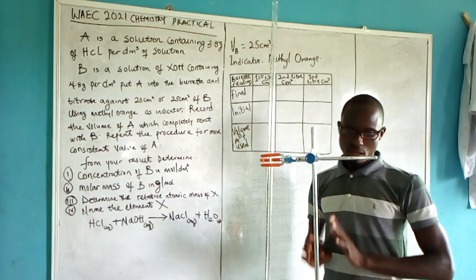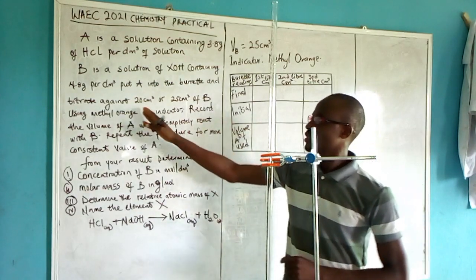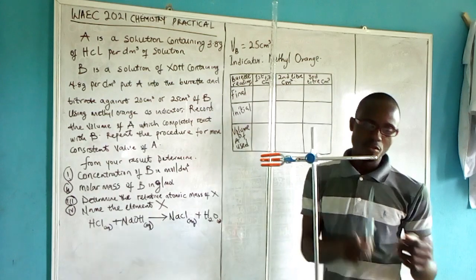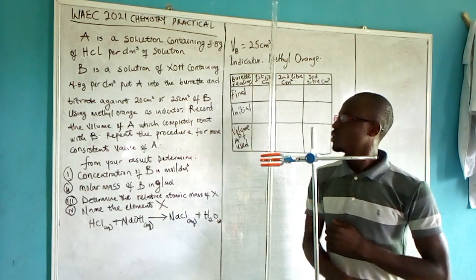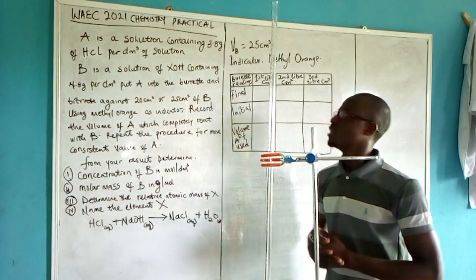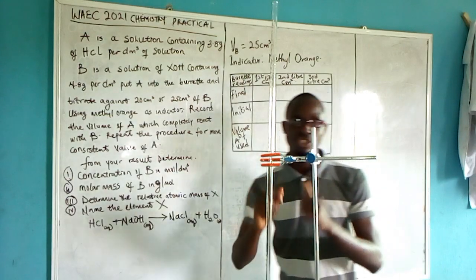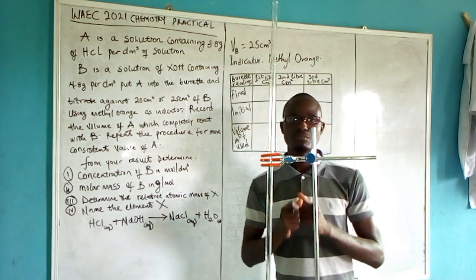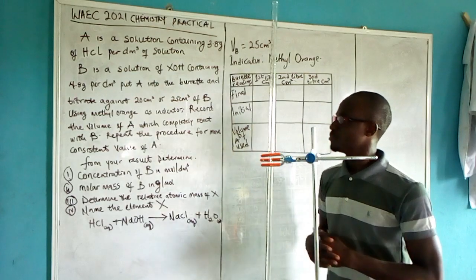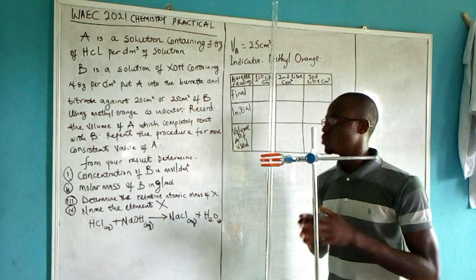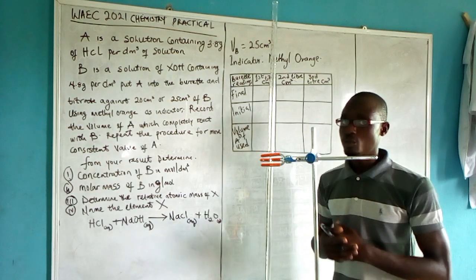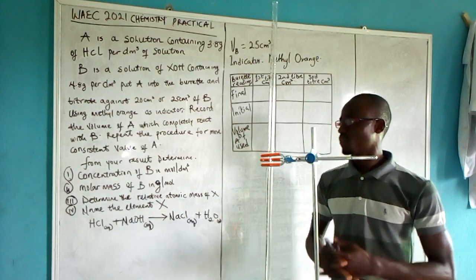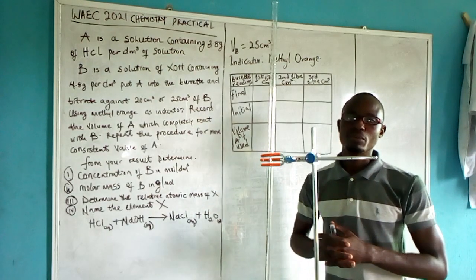Put A into the burette and titrate it against 25 cm³ of B using a pipette. We are using methyl orange as the indicator, because the reaction is between a strong acid and a strong base. Record the volume of A which completely reacts with B — the color change notifies us when the endpoint is reached — then repeat the procedure for consistent values.